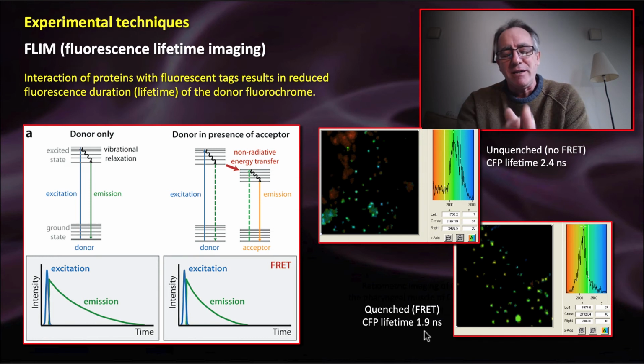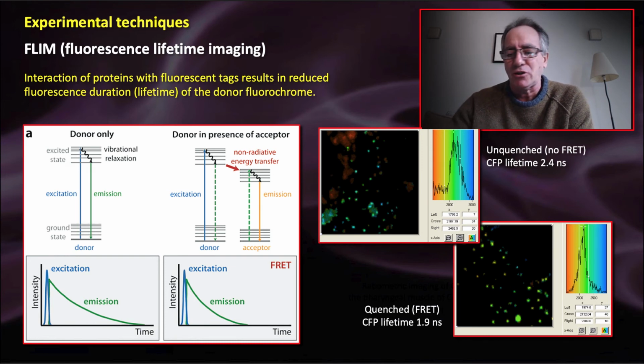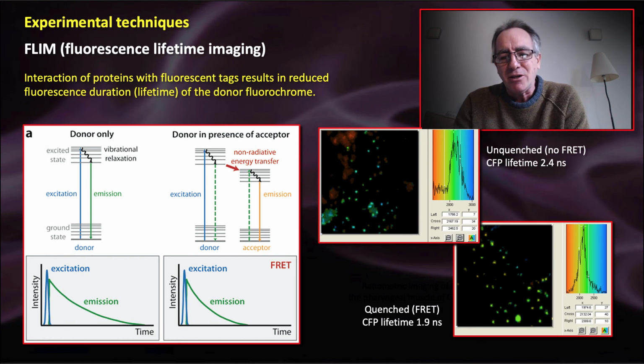I remember being there on the day doing the experiment. This was down at the Central Laser Facility down near Didcot in Harwell in Oxfordshire. It's this amazing building that has all of this high energy physics. They've got big giant lasers, giant microscopes everywhere, and these guys were doing this FLIM experiment with us. And I saw this result, the one that's indicated down here, and I was underwhelmed, to say the least. I looked at it and I thought, okay.